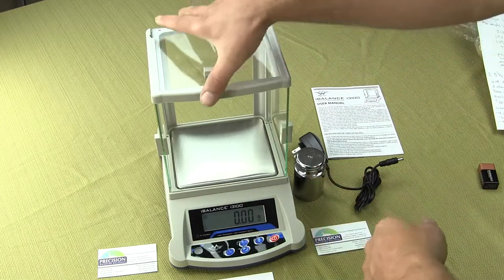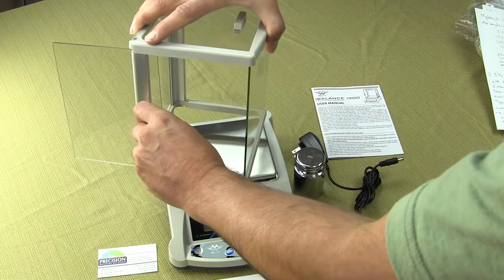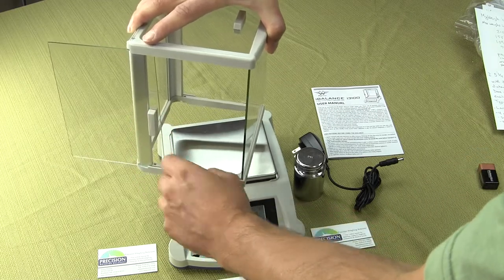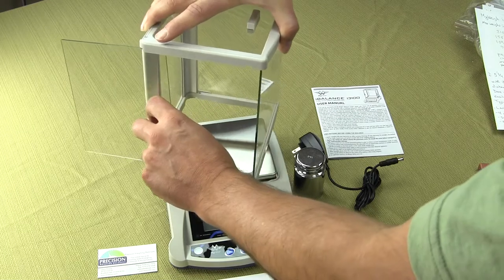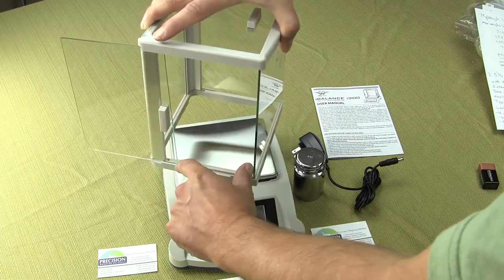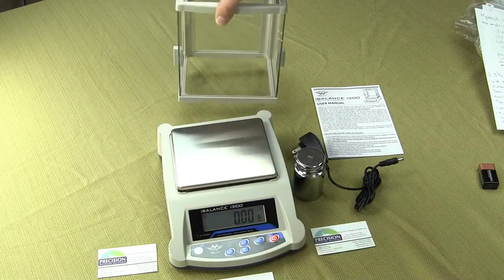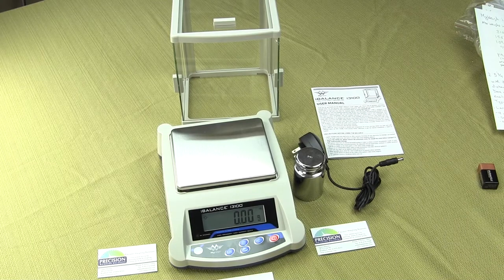The door openings on the side, when you open the door, you get about four inches altogether. We get calls from people who want to know how wide the door will open — maybe they have a silicon wafer or something they need to put in there. You only have four inches, but again this balance goes to 0.01 grams so many people would use it without the draft shield.